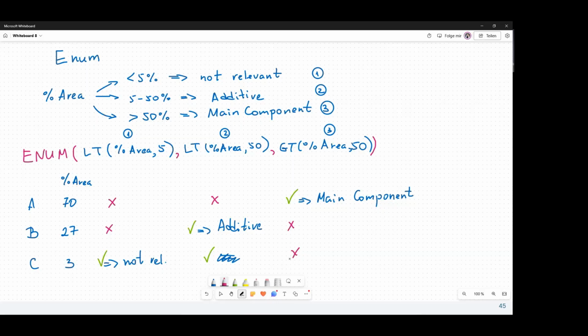That's why it's important in which order you set your questions. Yeah? So the order here matters because the first answer yes is being reported. So that is a very important moment here. I hope everyone understood it.